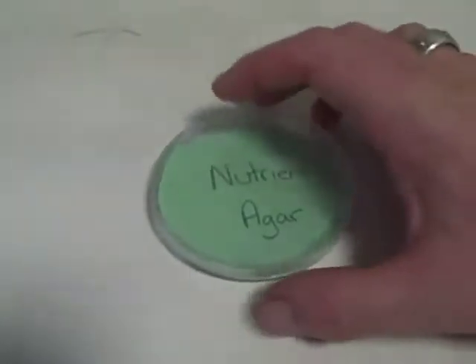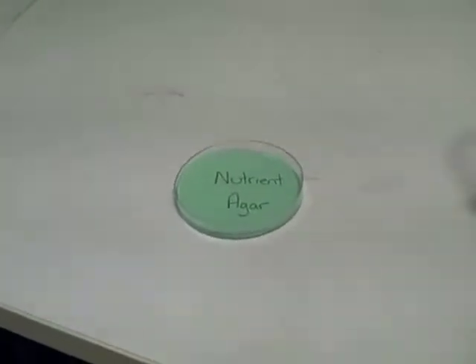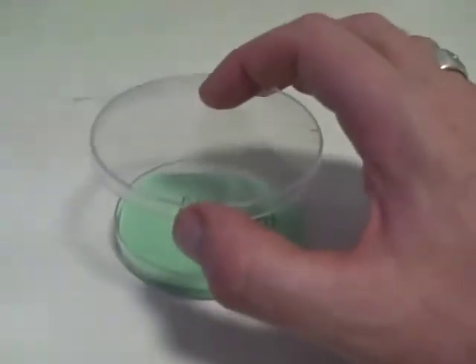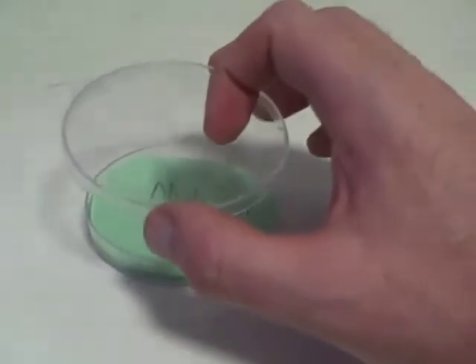One thing you don't want to do is this, because you're going to get microbes falling into here from the air. Whenever you need to open your plate, either do it yourself or get someone else to hold the lid up like this. Means you can access it, but dust should not be falling in, because we want to be sampling bacteria in particular from various sites around so that we're growing those and we know where they came from.